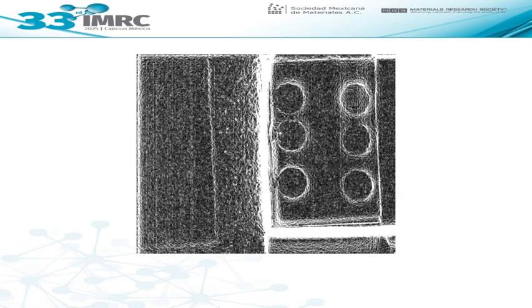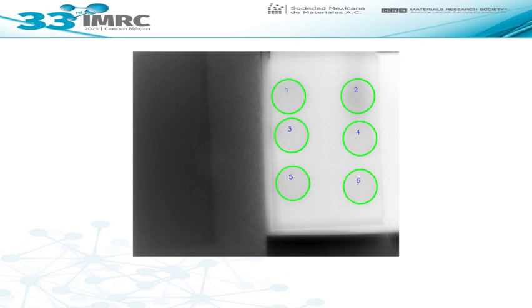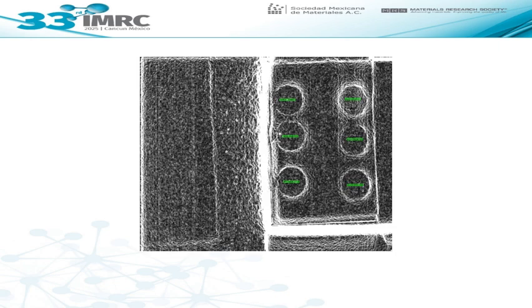Now, with the contours well established, we indicate our sites of measurement to obtain the coordinates of the regions of interest, or ROIs. With these ROIs, we can extract the intensity of the energy emitted by the sample and try to understand its behavior through the complete experiment.